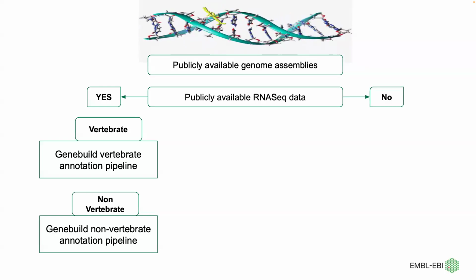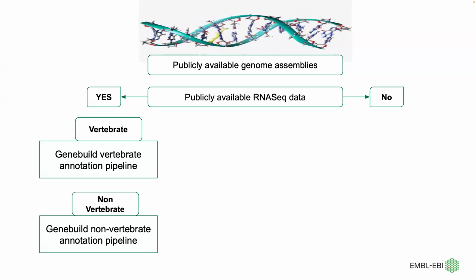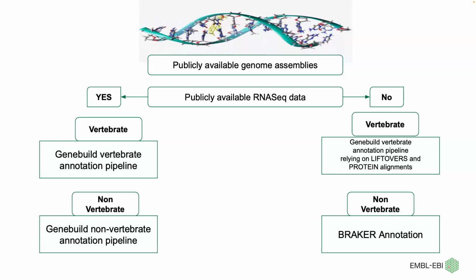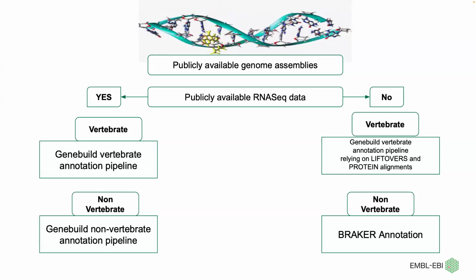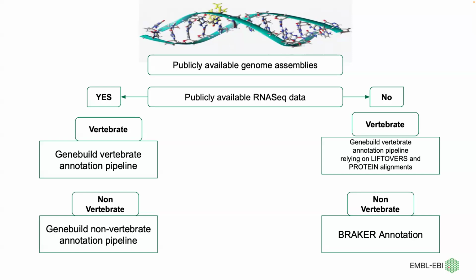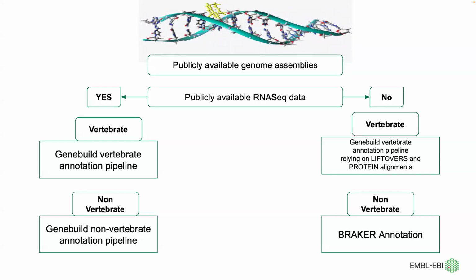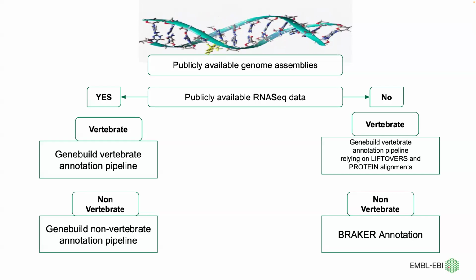And in case the RNA-seq data is not available and we are doing a vertebrate annotation, we still rely on our annotation pipeline, but since the RNA-seq data is not available, we rely mostly on liftovers and protein alignments.